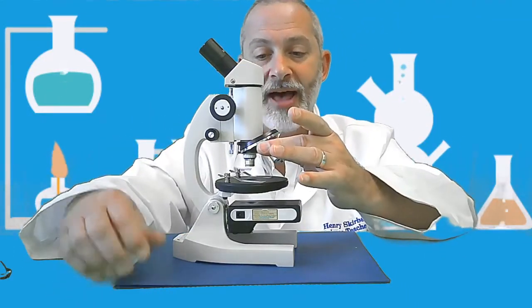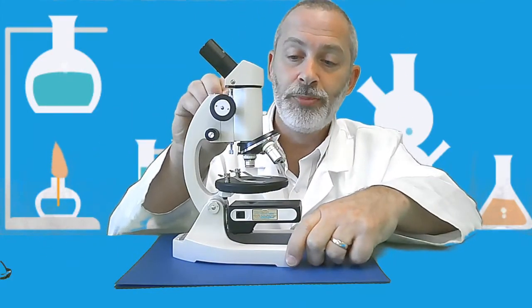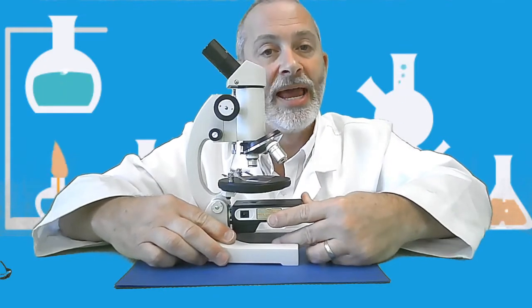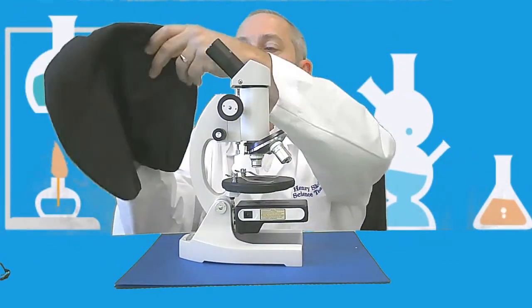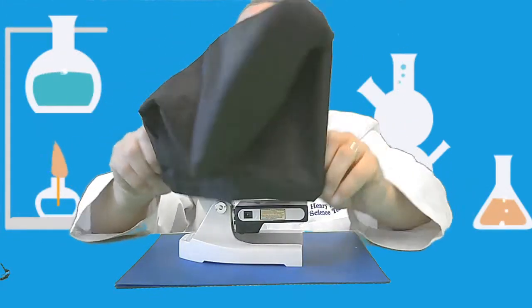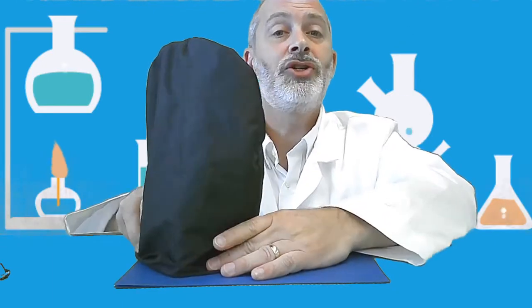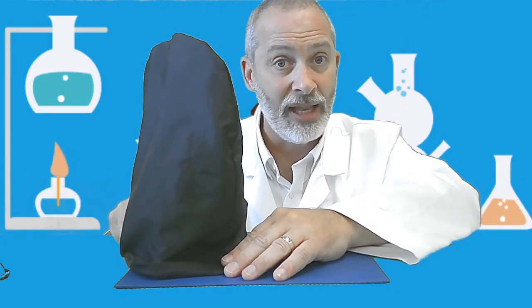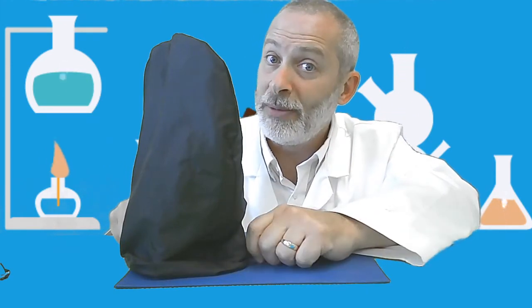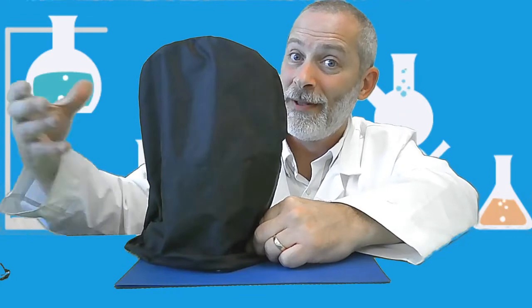So now we have low objective power, body tube all the way down, lamp is off. We can now return the cover to the microscope and carry it back to the microscope cart or cabinet in the back of the lab, remembering your ABCs. And everybody tell me, what do they stand for?